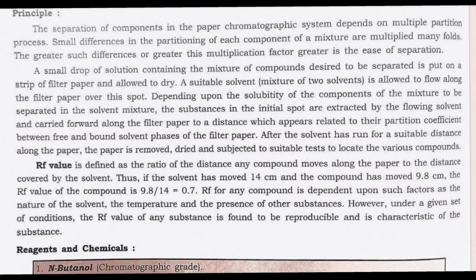Depending upon the solubility of the components of the mixture to be separated in the solvent mixture, the substances in the initial spot are extracted by the flowing solvent and carried forward along the filter paper to a distance which appears related to their partition coefficient between free and bound solvent phases of the filter paper.